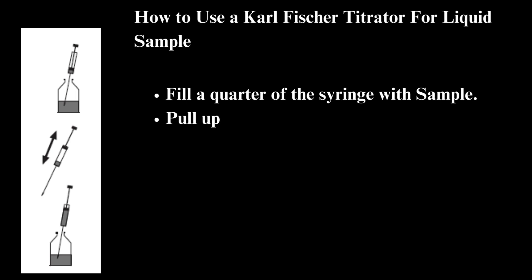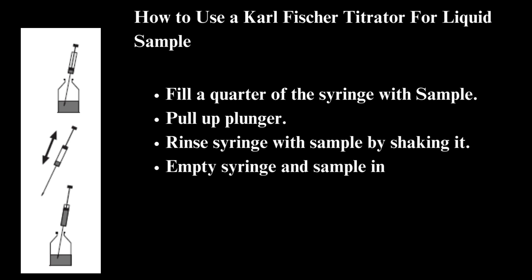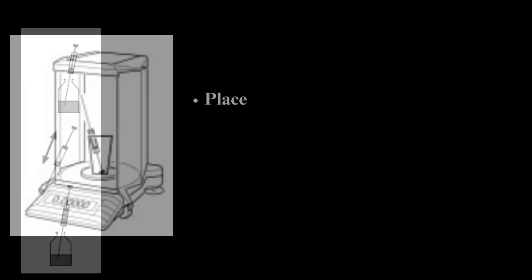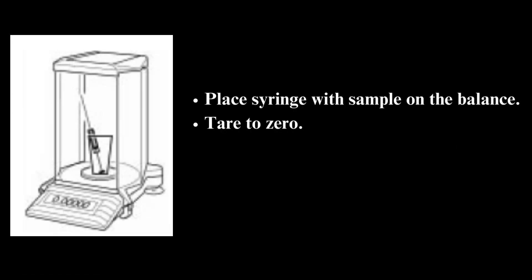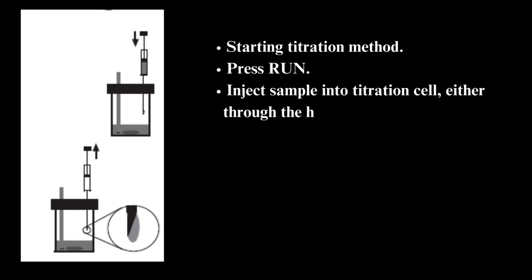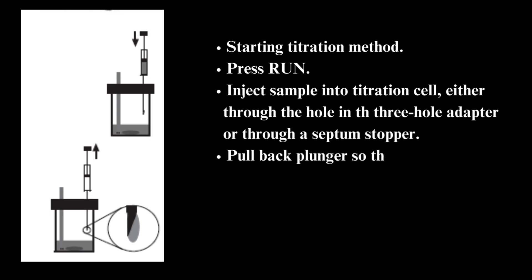How to use a Karl Fischer titrator for a liquid sample: fill a quarter of the syringe with sample, pull up the plunger, and rinse the syringe by shaking it. Empty the syringe and sample into the waste bottle. Fill the syringe with sample and wipe the needle with a paper towel. Place the syringe on the balance and tare to zero. Start the titration method, press run, and inject the sample into the titration cell — either through the hole in the three-hole adapter or through a septum stopper.